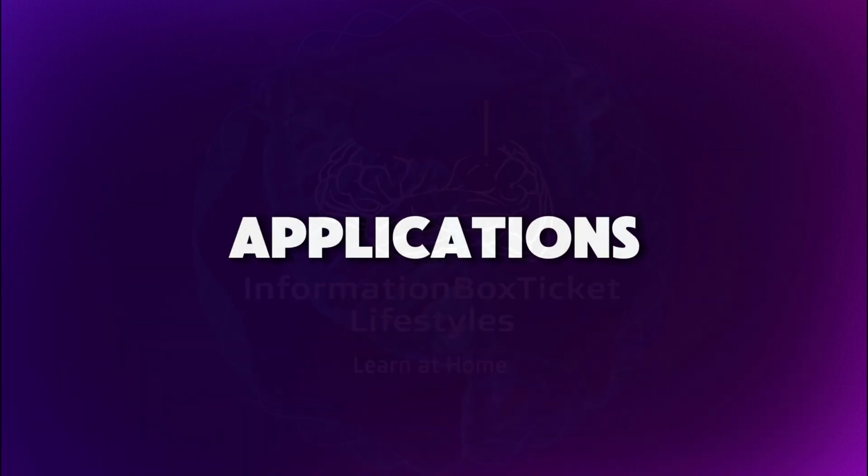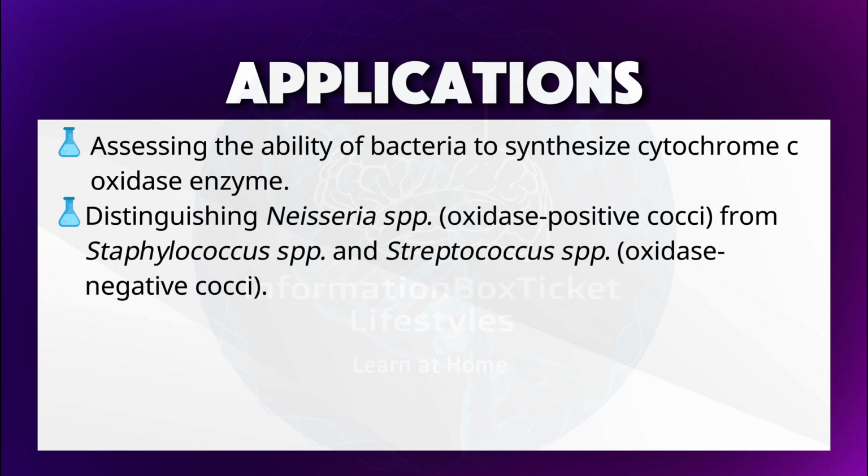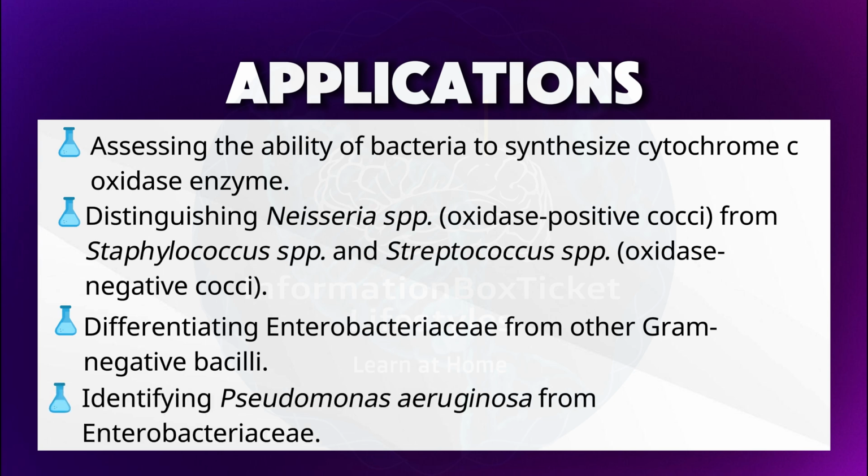Applications of oxidase test. Assessing the ability of bacteria to synthesize cytochrome C oxidase enzyme. Distinguishing Neisseria spp, oxidase positive cocci, from Staphylococcus spp and Streptococcus spp, oxidase negative cocci. Differentiating Enterobacteriaceae from other gram-negative bacilli. Identifying Pseudomonas aeruginosa from Enterobacteriaceae.